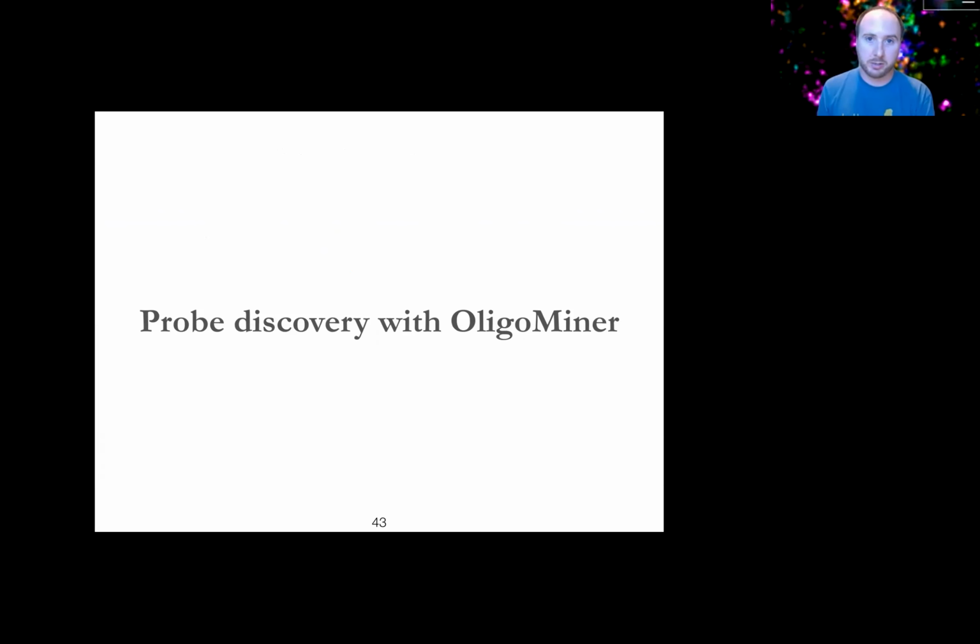So I just want to put a quick plug out there for how we actually get the probe sequences themselves, because this is a really important aspect of how all this works. And if you want to go do this yourself, you're going to quickly run into this problem.